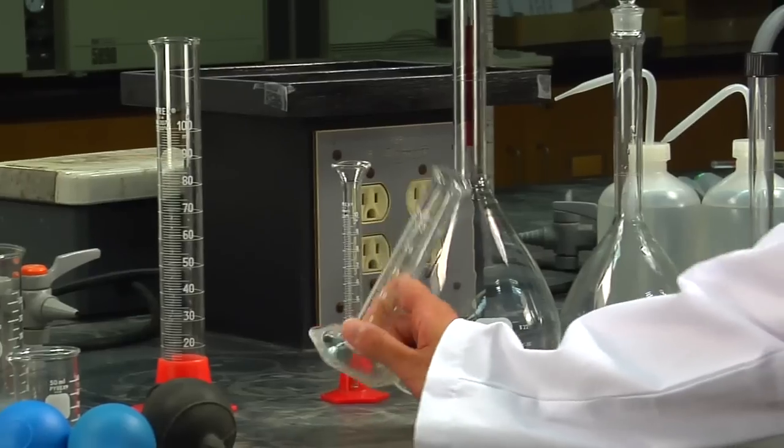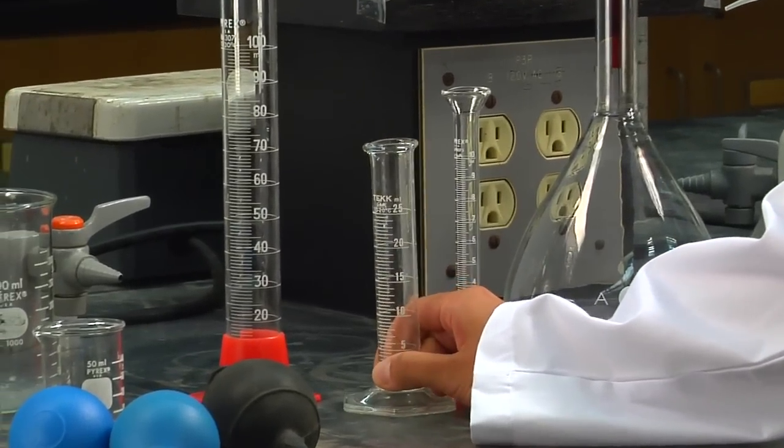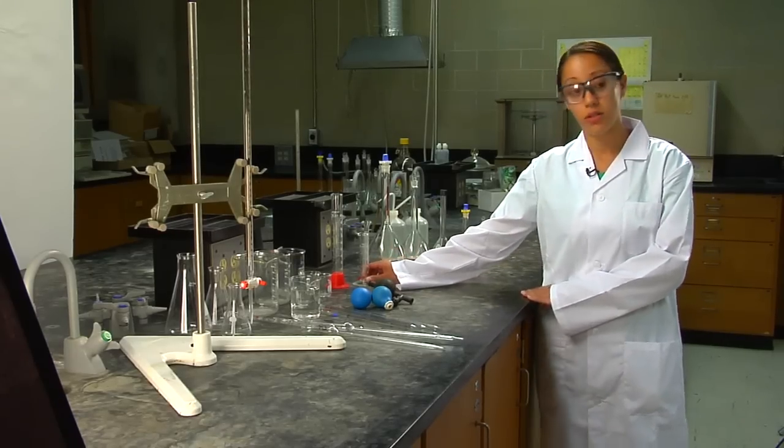We also have some graduated cylinders which you won't be using too often because the error in using these graduated cylinders is quite high.